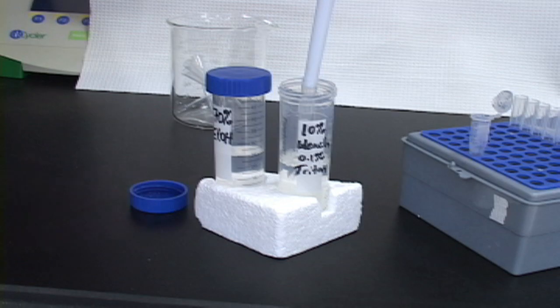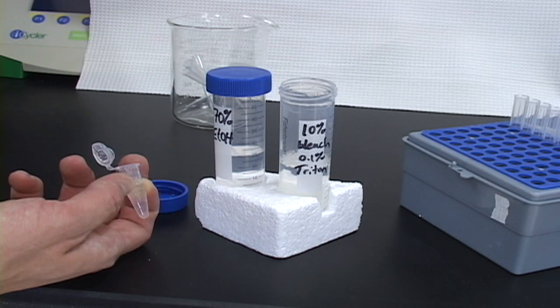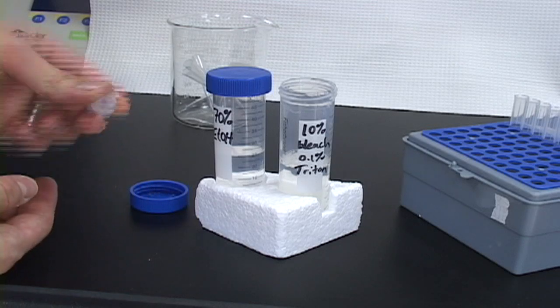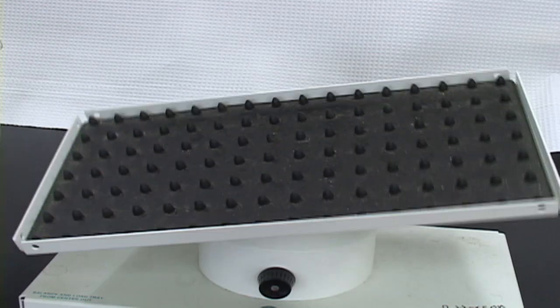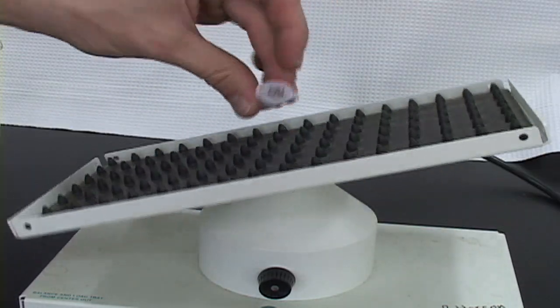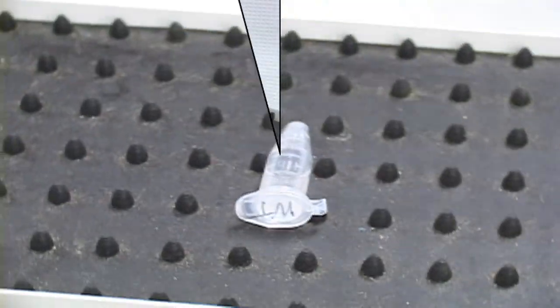Next, add 1 ml of bleach solution to the tube. Close the cap, invert the tube several times to mix, and then place on a nutator or similarly moving device. If a nutator is not available, the same motion can be achieved by using your hand and wrist. Allow the seeds to wash in bleach solution for 20 minutes.